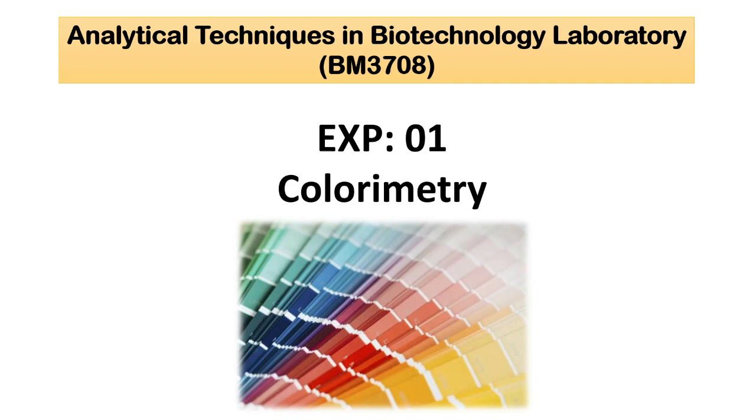We will see how different objects, say food products, leaf, whatever you can think of, can be analyzed. You can also analyze your skin color using this device, and see how the color changes when you put different biological samples into the instrument. In my last theory class, I discussed color as a qualitative and quantitative parameter.